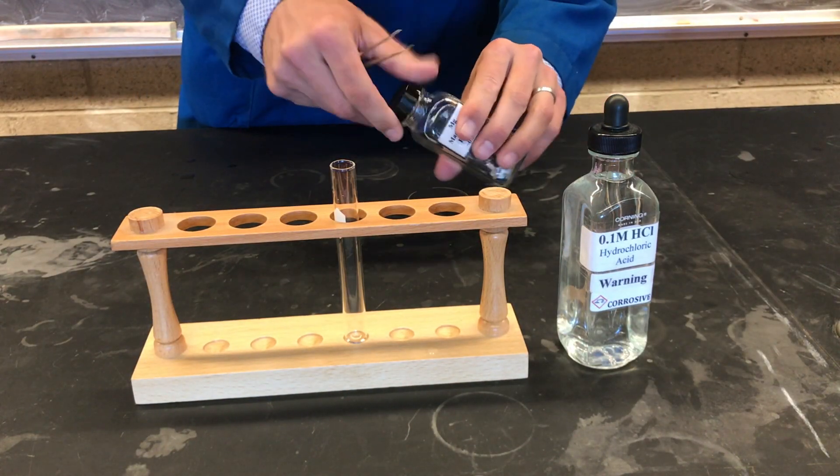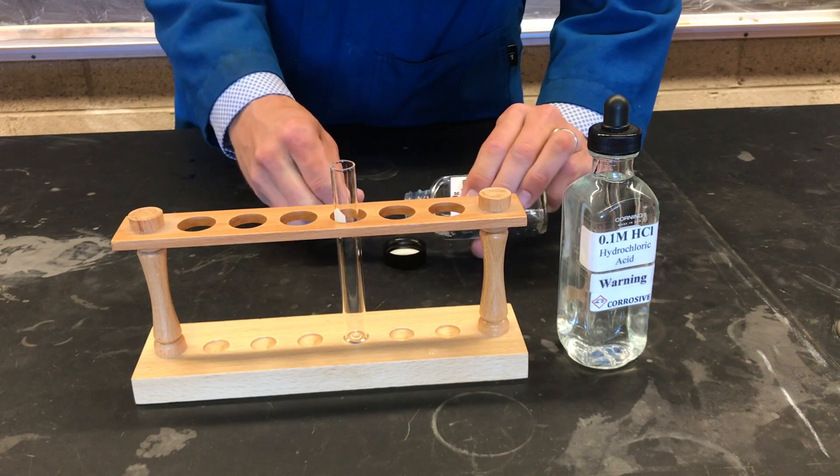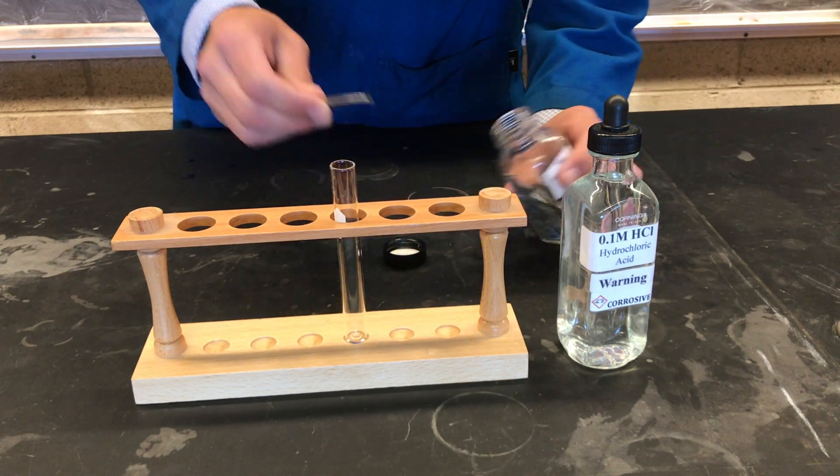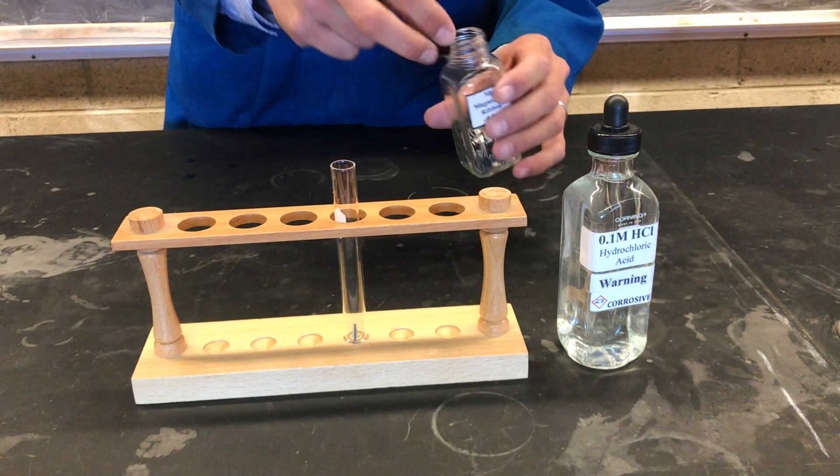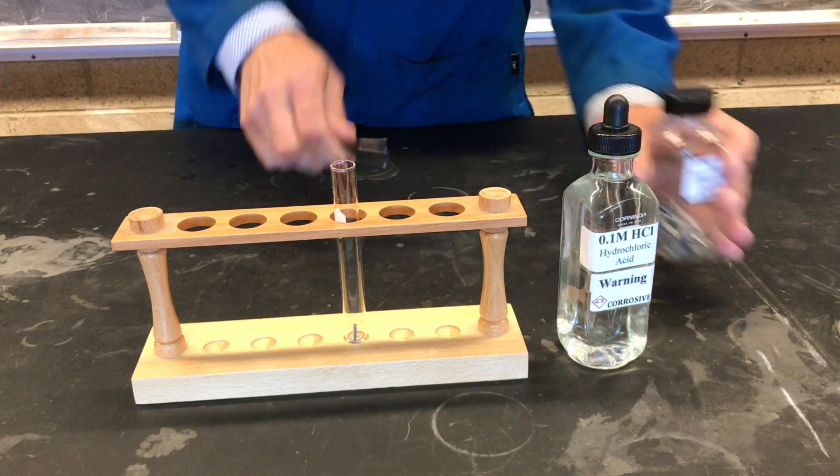Next, we're going to take a piece of solid magnesium metal, such as this one, and add it to a clean test tube and react it with aqueous hydrochloric acid.